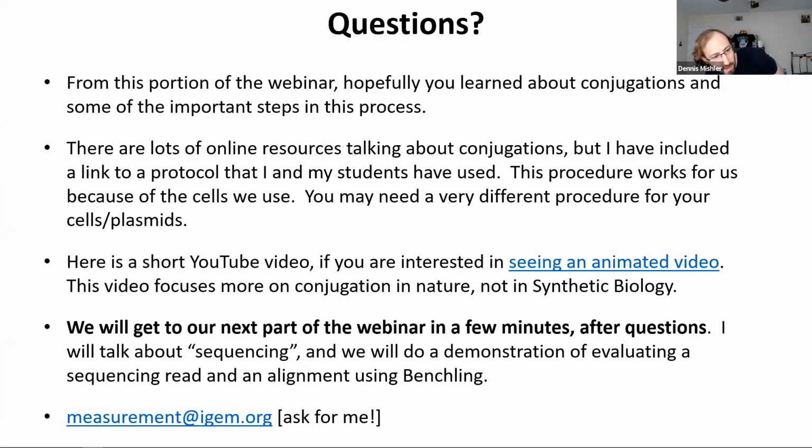Yeah, a couple other people have tried to also answer this, what do we mean by wash? And yeah, like they said, you're going to be centrifuging stuff, removing the supernatant or the buffers, and then taking the cells, resuspending them, and moving them forward.